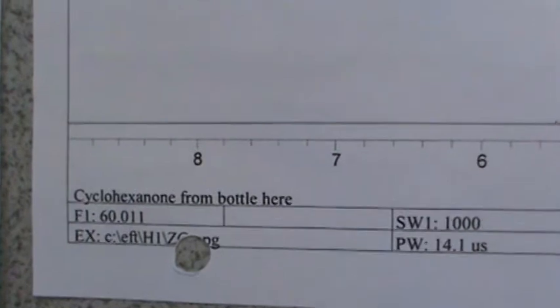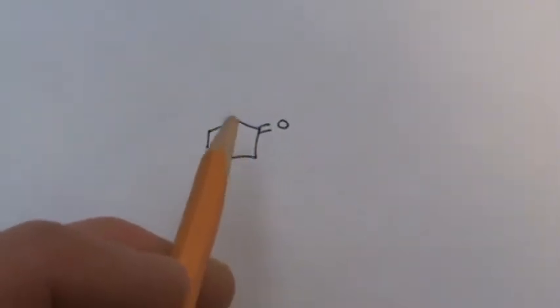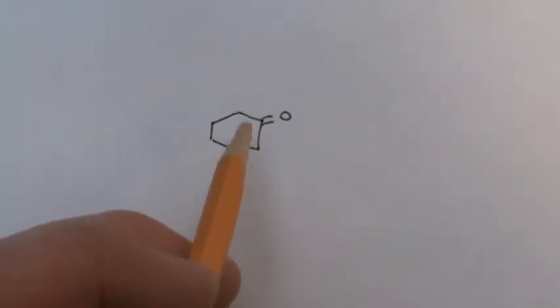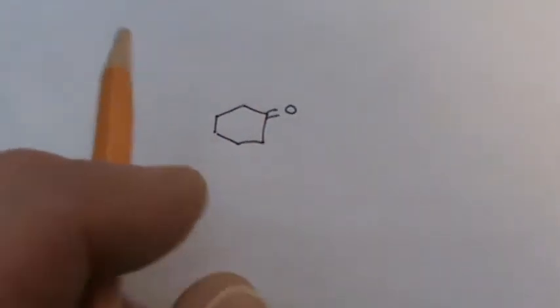Now as far as the cyclohexanone, this spectrum is essentially a reference spectrum because it comes straight out of the bottle. It's 100% pure, run on our instrument. So again, we definitely would expect that the 4 hydrogens at these 2 positions, some are up, some are below the ring. You're not going to get N+1 coupling. Something worth 4 should be slightly more left than these 3.